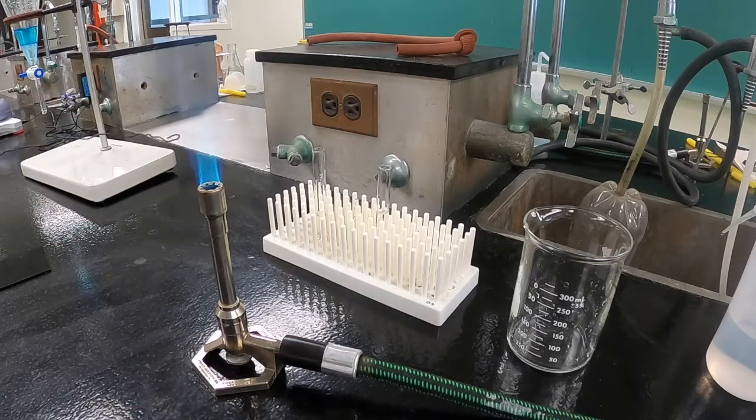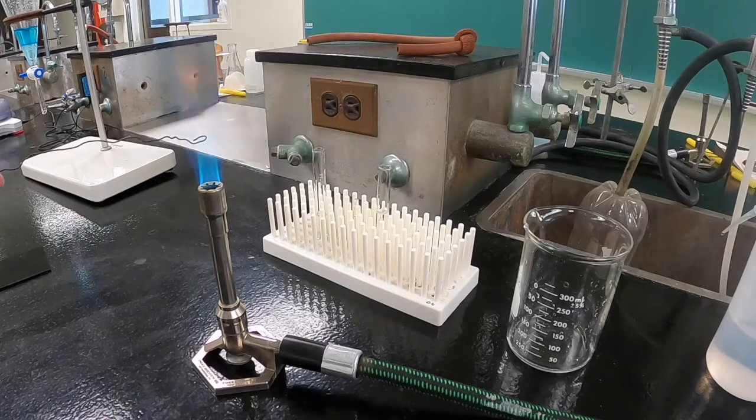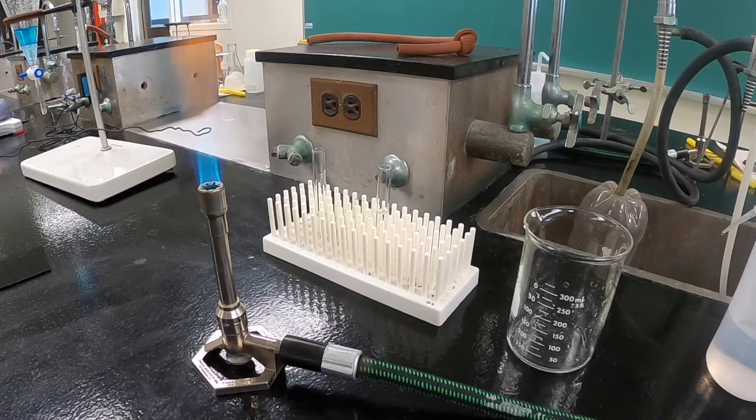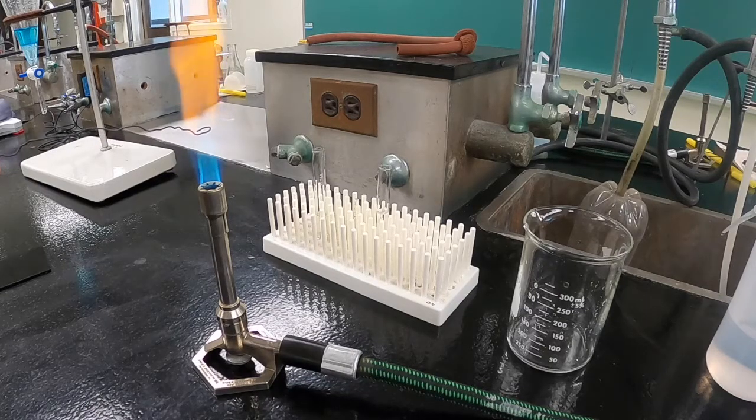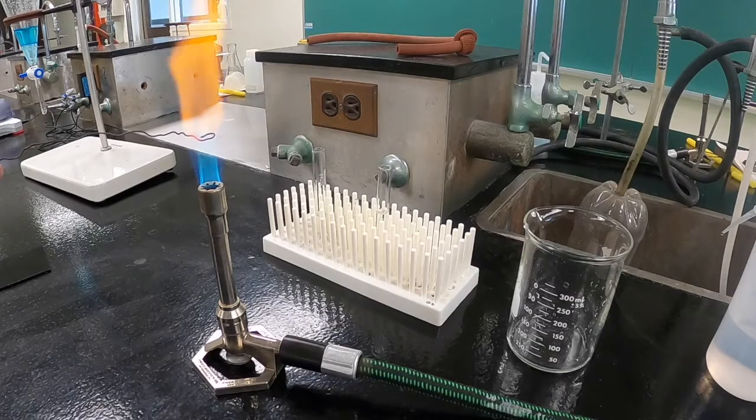You should then heat the wire in a Bunsen burner flame and you want to continue heating until the flame color stabilizes. And this may take a moment.